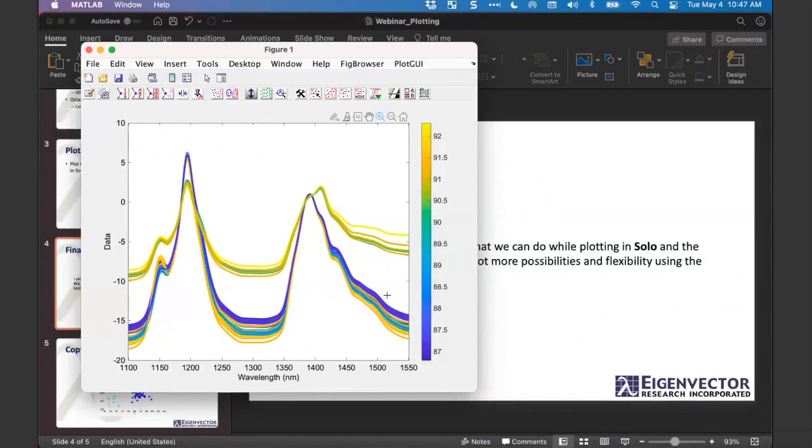So you could, in theory, have a little piece of code that will standardize the look of your figures, if that's what you're looking for. That's something that I've done in the past, so it always automatically sets the same fonts and the same size.